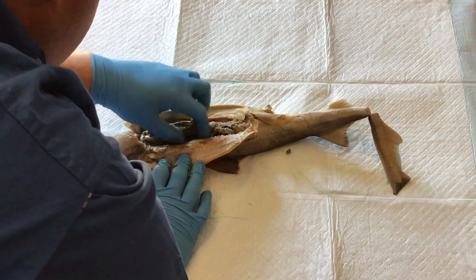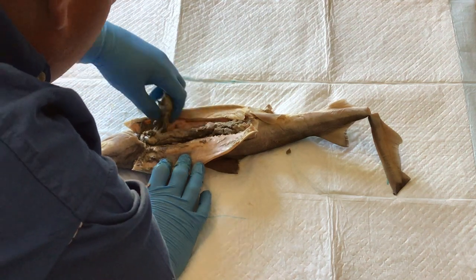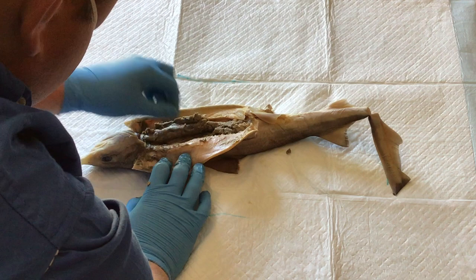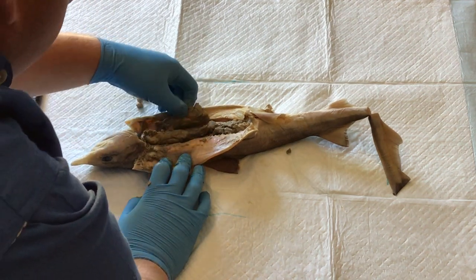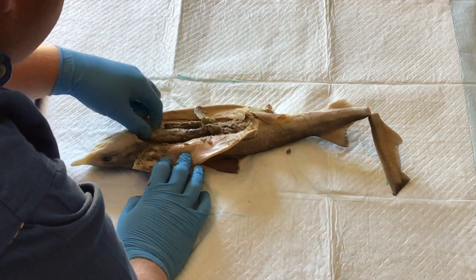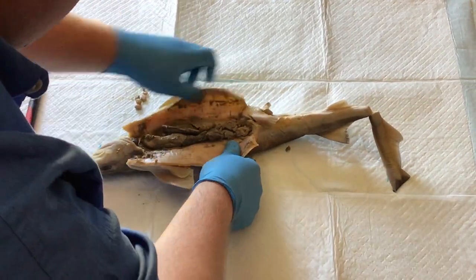Okay, I'm just noticing a few things as I'm cutting open. Some things I have not seen before, so I'll have to look this up afterwards. I believe these might be little babies. Not 100% certain. I've cut up a few dozen of these sharks over the years. I have never seen these things in there before, so I'm not exactly sure what they are. But this is going to be a little challenging for those of you that are a little squeamish. So I do apologize.